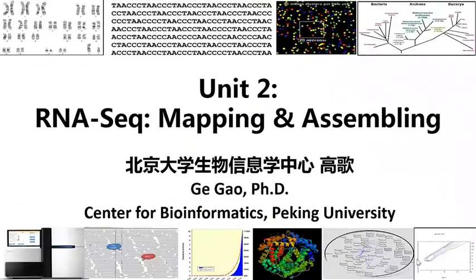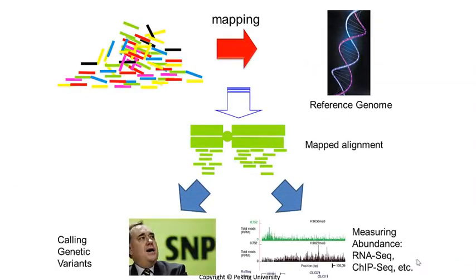Let's continue this week's topic, transcriptome study by deep sequencing technique. In the last unit, we briefly introduced the basic background and experimental measurement techniques of transcriptome study. In this unit, we'll explain the specific methods of RNA-Seq starting from the reads mapping.